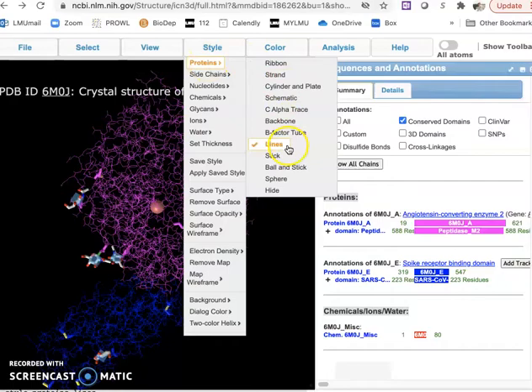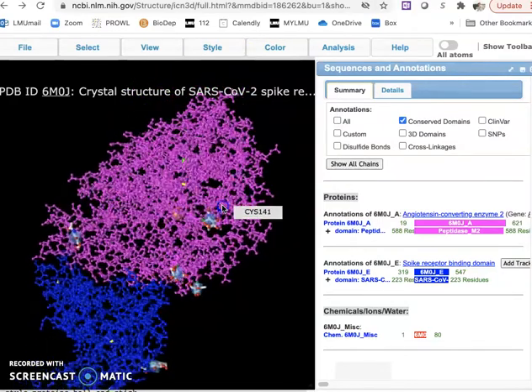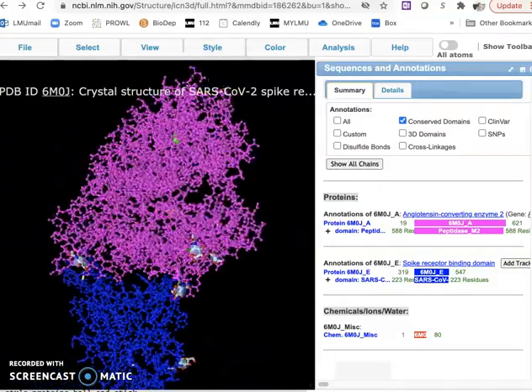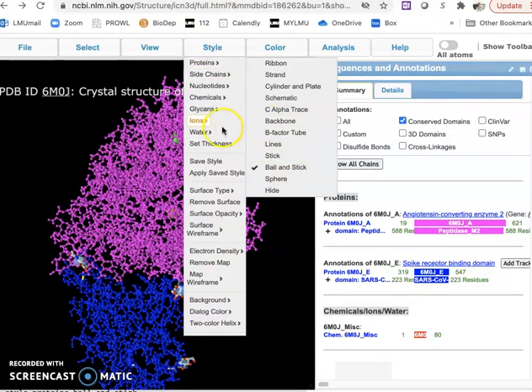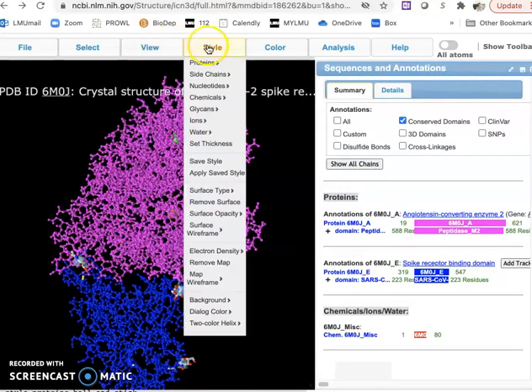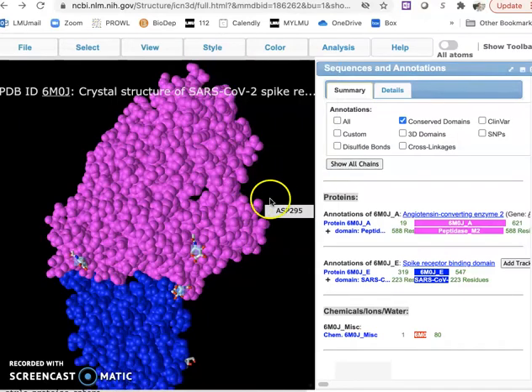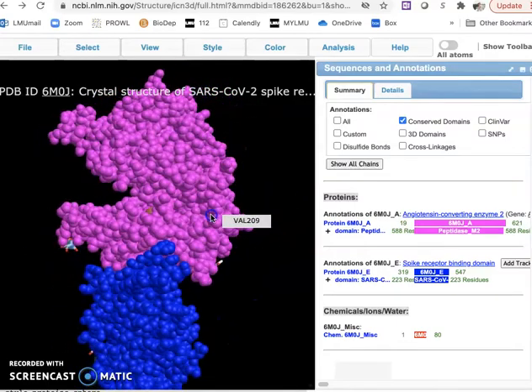Ball and stick is a good one if you want to see the interaction between specific molecules, so we'll refer to it a little later. The same goes for the spheres. My understanding of spheres is they show how the outside of the protein may look like.